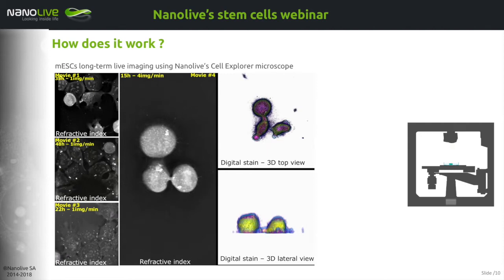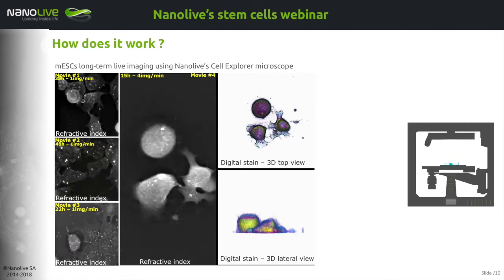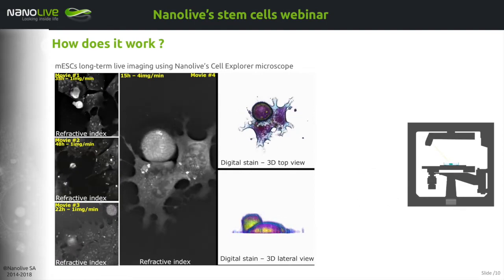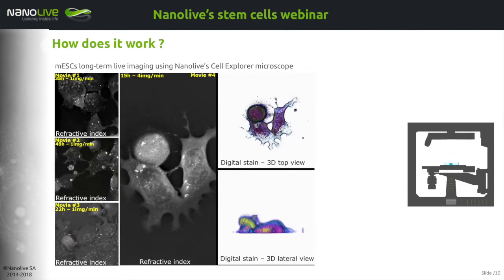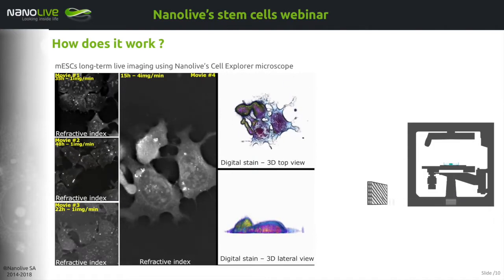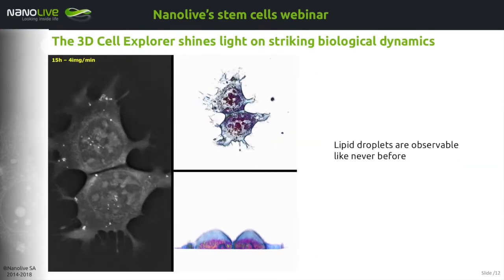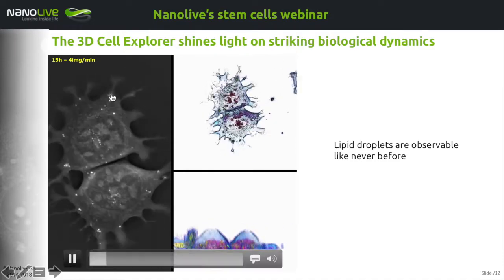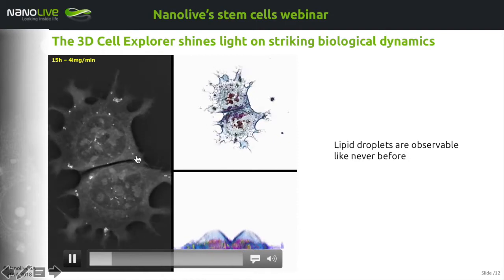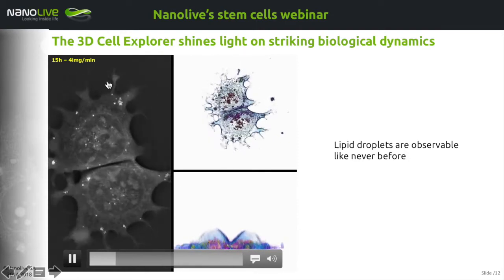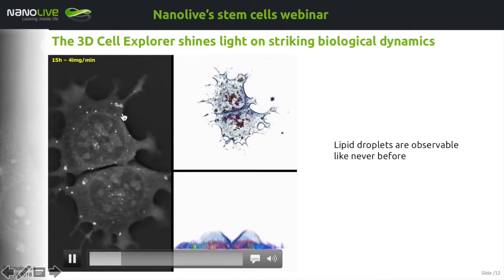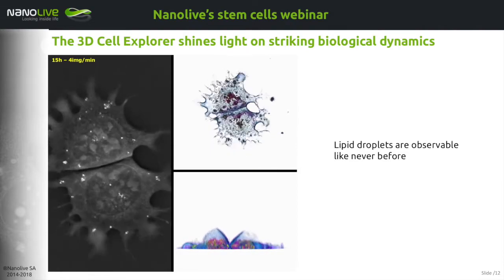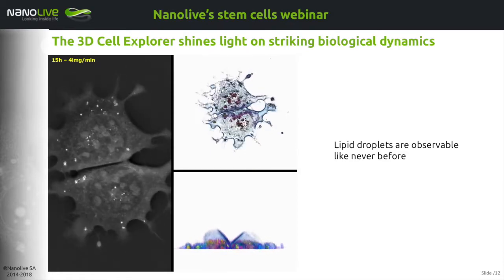So now let's see what type of biology can be observed with our microscope, and I will guide you through a couple of dynamic processes that we could image like never before. The first organelle I would like to speak about are lipid droplets. Lipid droplets are those white dots within mouse embryonic stem cells that you can see moving all over the place. Lipid droplets are storages for lipids, and therefore they are of high interest for people studying metabolism.